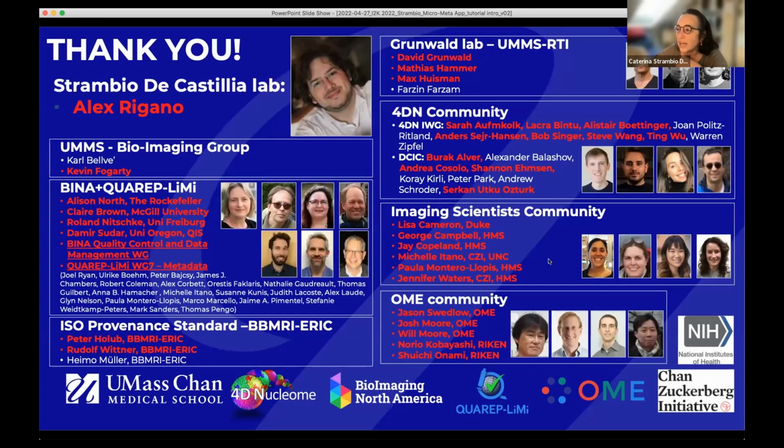And I want to thank everybody. Alex Rigano is the developer of Micro-Meta App, and you'll hear about Joel, who is the developer of MethodsJ2. So now we can go to the actual live demo.